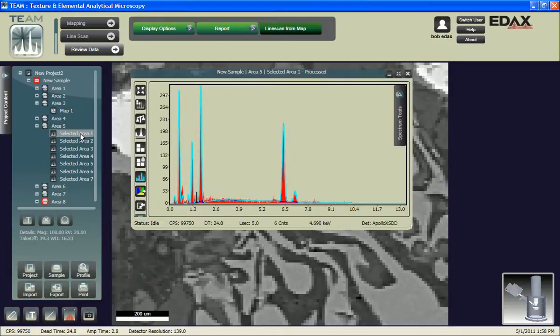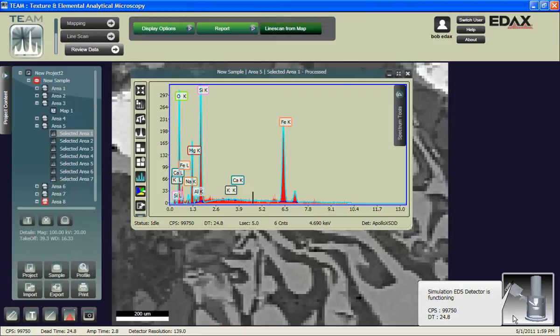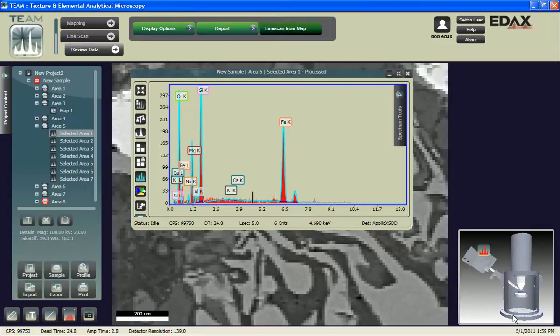So I double-click on the very first one. So again, I double-click on the first phase, and we're seeing the elements shown here. And I'm about to make a mistake, because I want to make sure that you understand how we actually implement the feature that we're trying to use, because we don't always, while we're playing around with the software, want to use this feature.